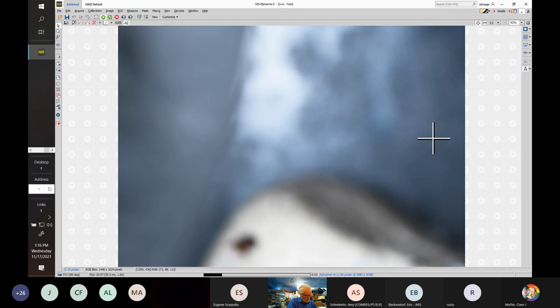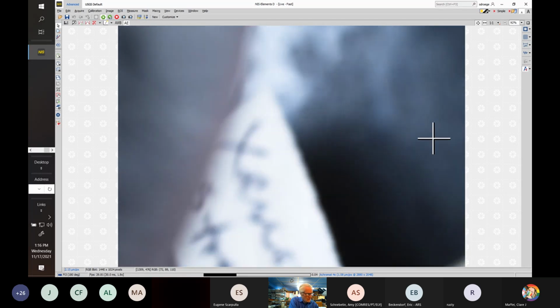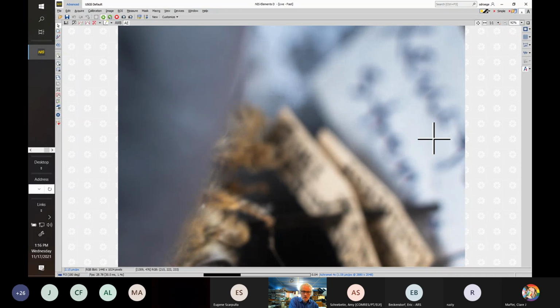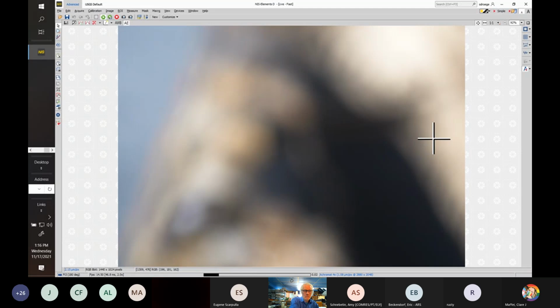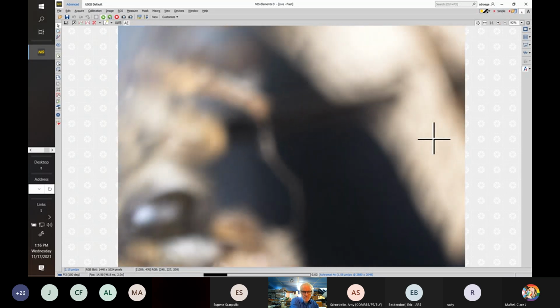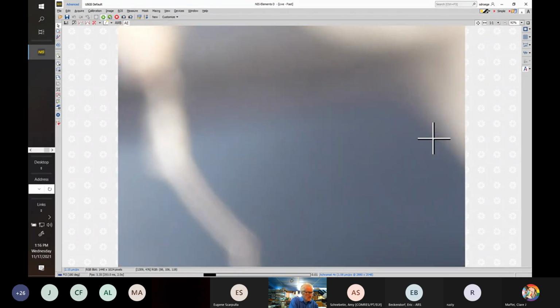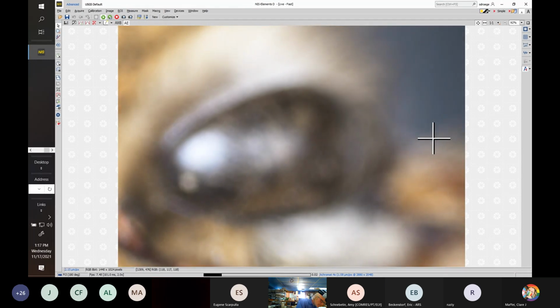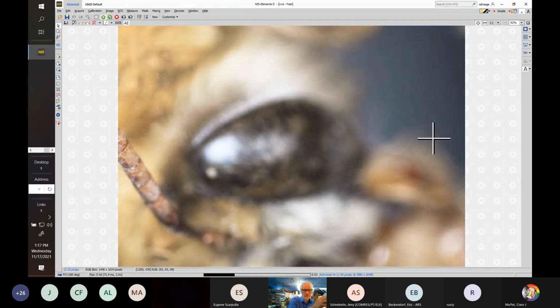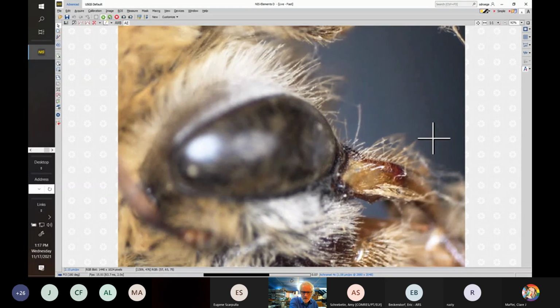Let me pull a female here. Very long tongues. And the female is going to be quite similar. This is a very old and almost therefore dirty specimen. Here I just want to show the tiny, this is canadensis, I think. Wait, is it? No, it's strenua again, but this is a female. We'll look for our little friend, and there it is.